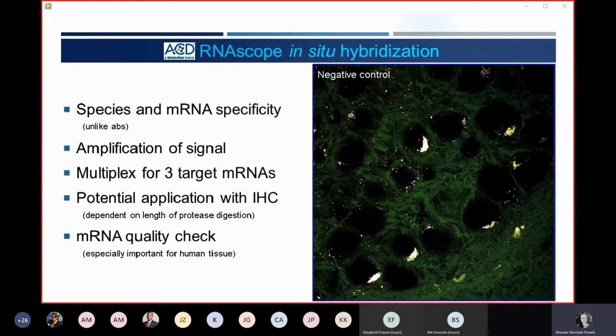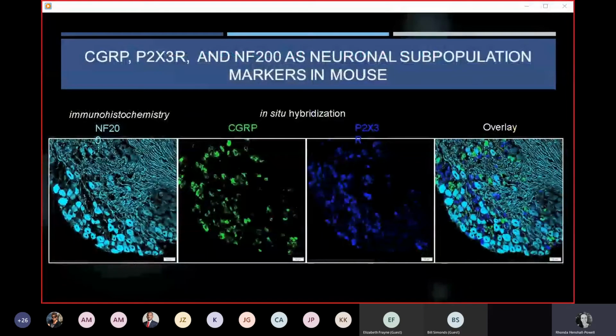For one thing, the lipofuscin autofluoresces in the green, red, and far red channels. So in the overlay image, you can see that these appear white. So it's really easy for us to rule out that this is a real RNAscope mRNA signal. The size difference is also a good indicator, because the mRNA puncta are much smaller than these, even the smaller lipofuscin puncta.